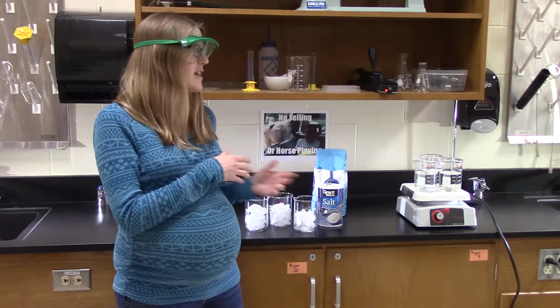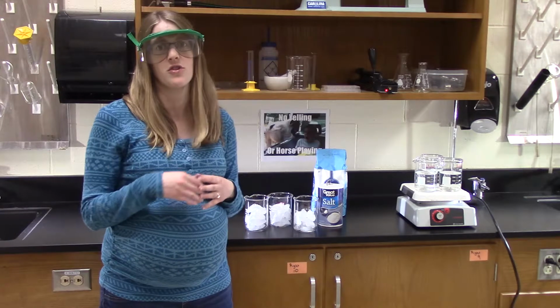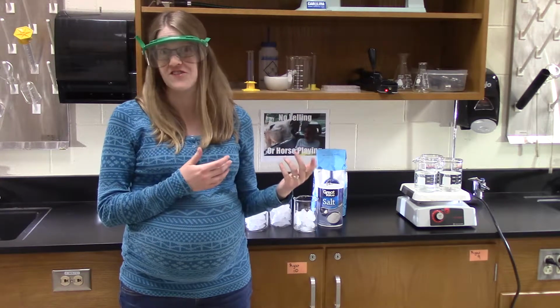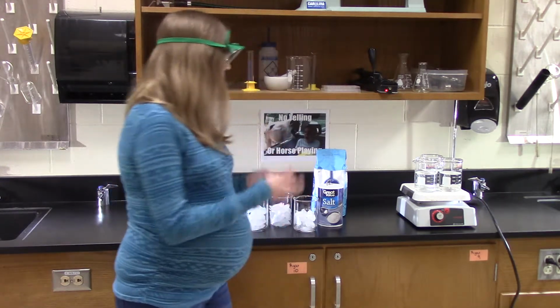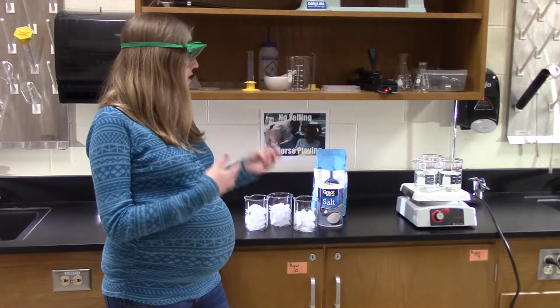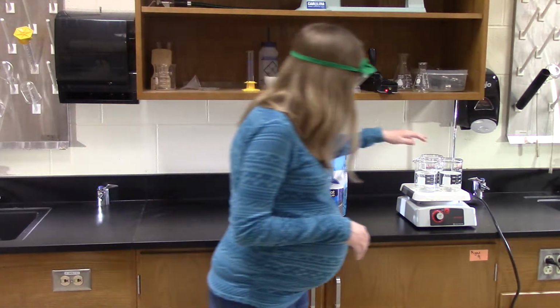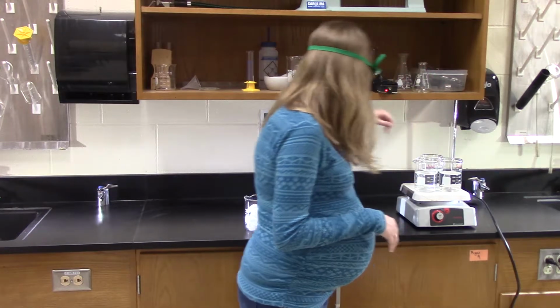And in just a few minutes, after I have this all set up for you all, I'll walk you through exactly how we know which one should have a larger effect. And then afterwards, I'll be able to show you what actually happened. So it would be best if I did some math and calculated out exactly the same concentration, but I'm just going to eyeball it. I put 225 mils of water in each of these.